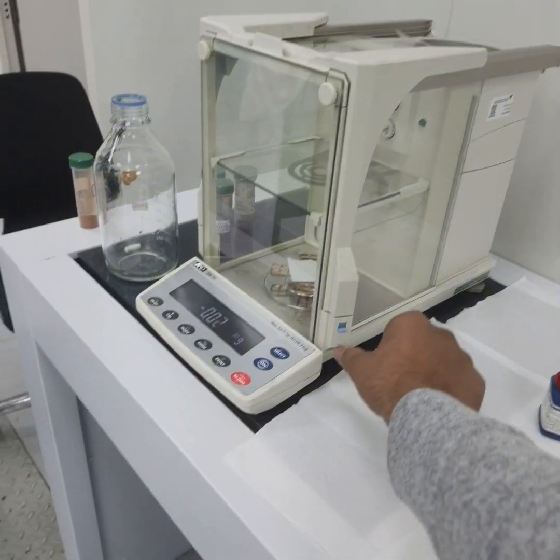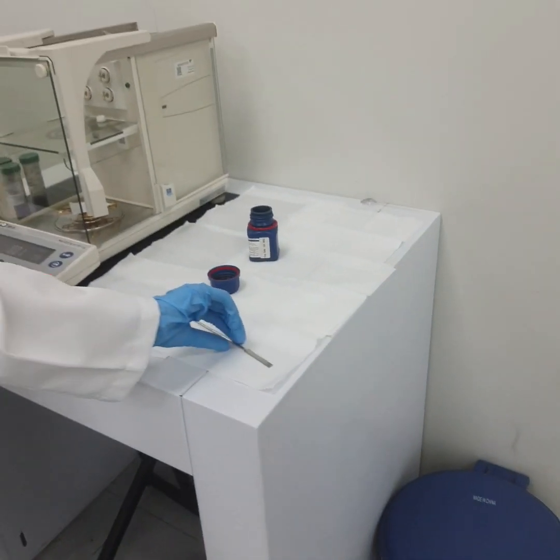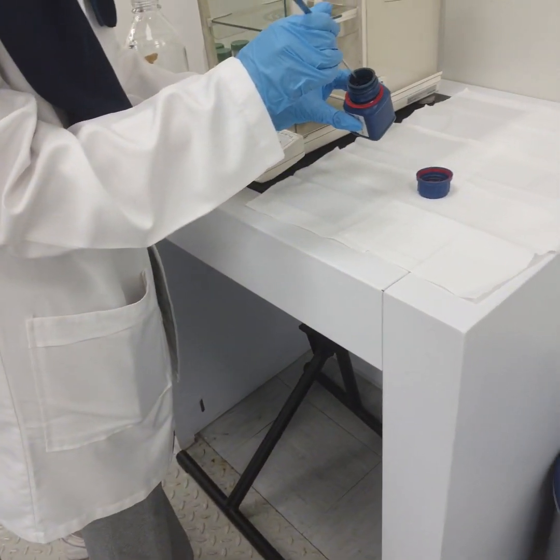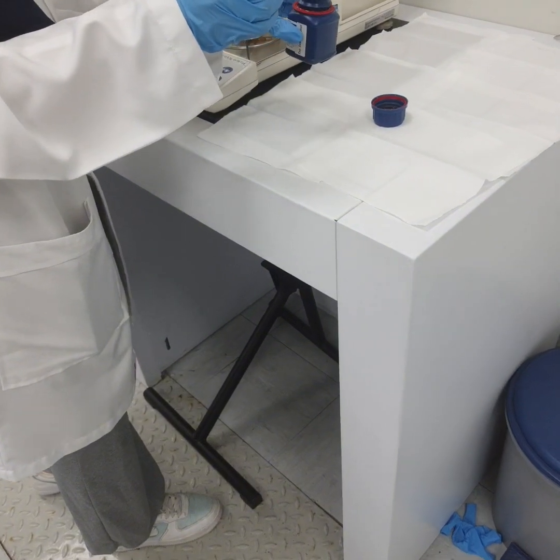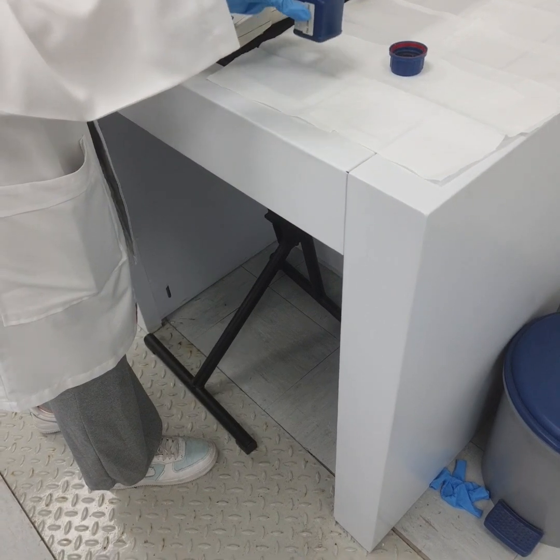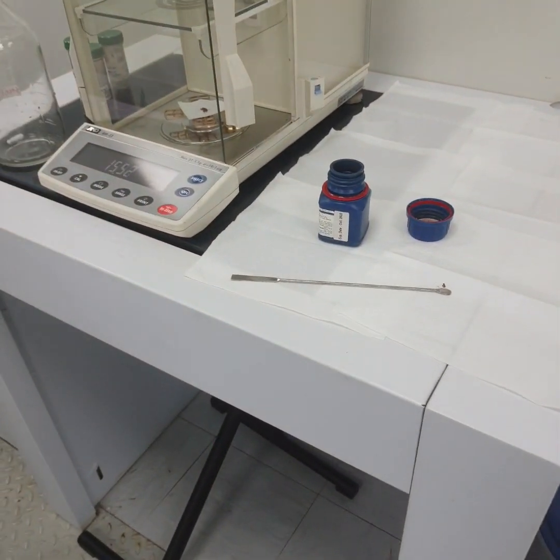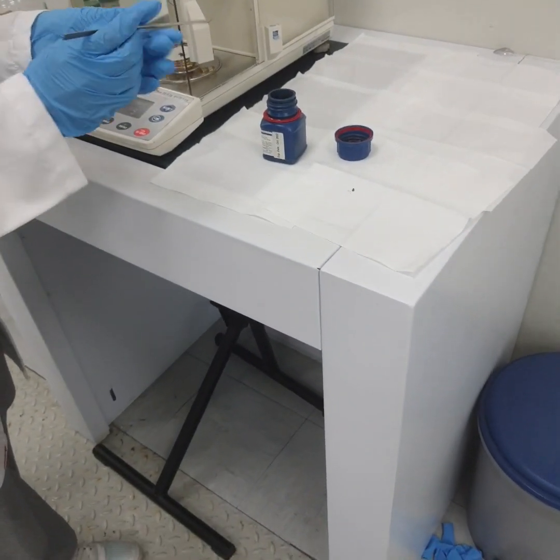This is now tared. Now add a very small amount of dye using the spatula, very small, just like when you add a pinch of salt. Just cut it down, a very small amount. Okay, add it on the paper. Just wait. Add more, the amount you took, add more.